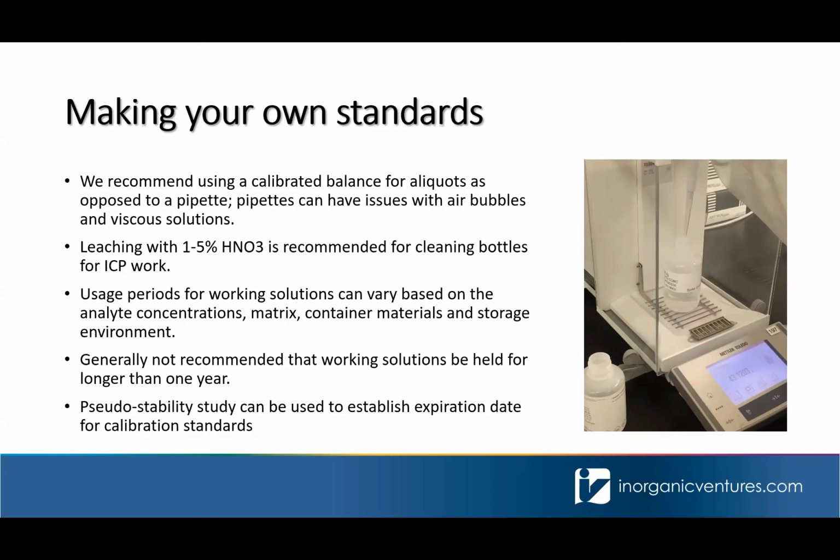The usage period is a key point for labs. You don't have to go through the process of making working solutions every time you want to do an analysis, so having some level of stability in your working standard is important. Based on the analyte concentrations, the matrix, and the container, as well as your storage conditions, the usage period of your working solution that you've prepared can vary. In general, what we say is that working solutions shouldn't be used for longer than a year at a time.